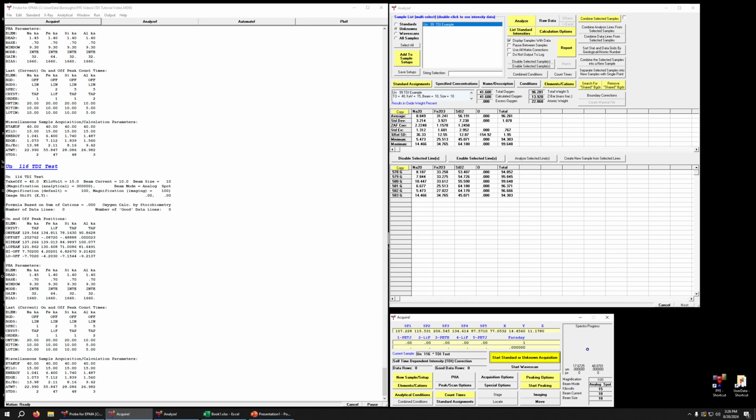So once you've enabled it, PFE will acquire the data for the samples, though as you'll see a little later on, you don't have to use the TDI correction even if you collect the data. You can enable it or disable it at will after the fact when you're doing your sample analysis and data reduction. I recommend enabling TDI as the default for basically all samples and elements.